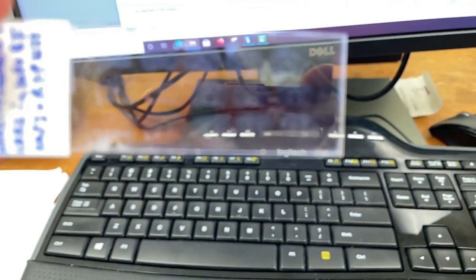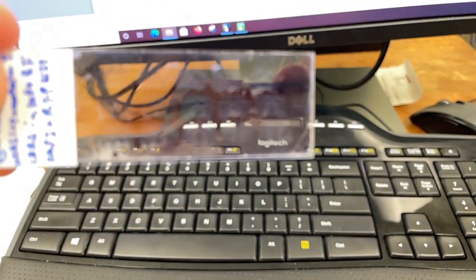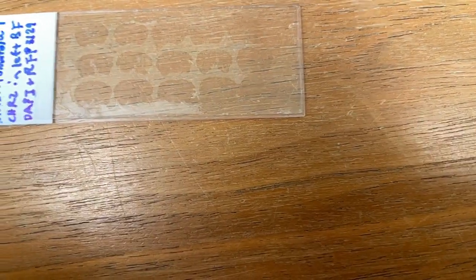Oh god. The mounting media on a lot of these is really pulling away. Like this, that's not what you want. Like in the corner, there's not supposed to be, focus. It's not supposed to be crud like that. I guess we'll see if it works. I hope it does.